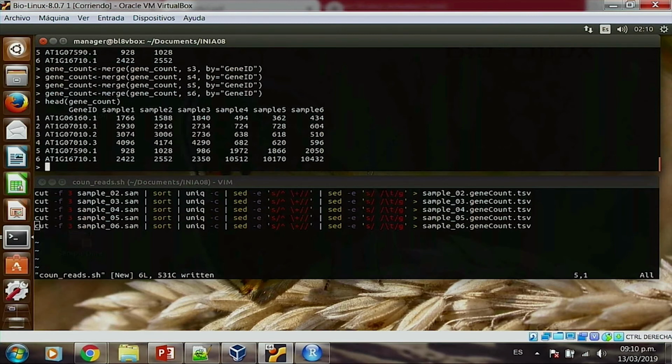No, you do need to do statistics. Just because I see it by eye, and this is pretty obvious when you look at it, doesn't mean that I don't have to run a statistical test to prove it. Every single journal is going to ask me, if you say something is significant, you need to show a statistical test that proves it is statistically significant. Otherwise, they won't accept it.